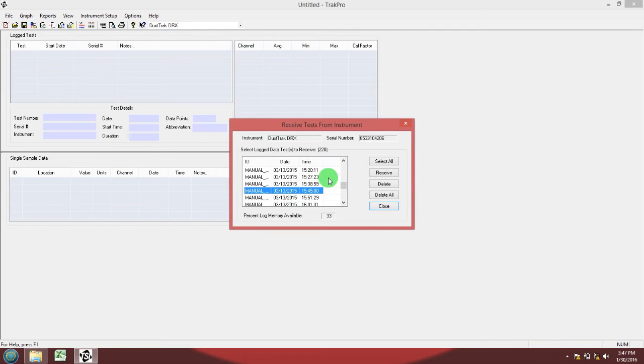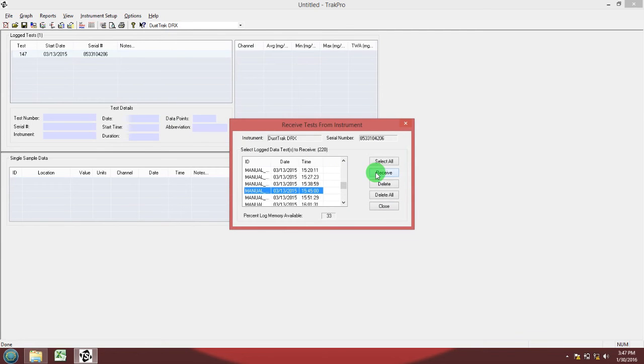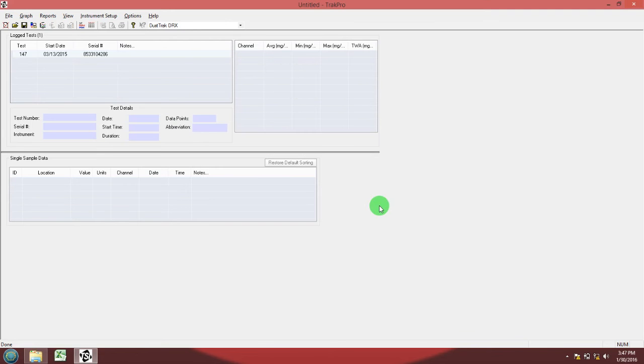Hit receive. Hit close. Now the data is inside the TRACK PRO software on your computer.